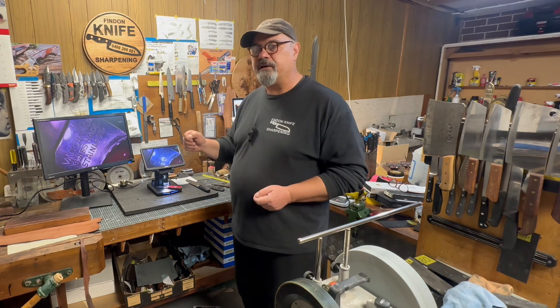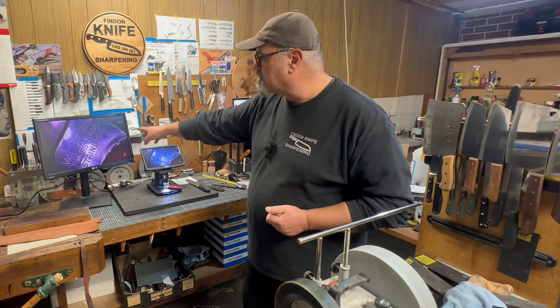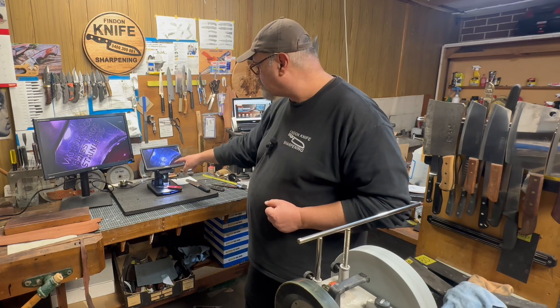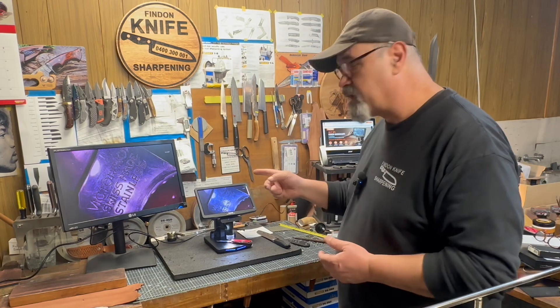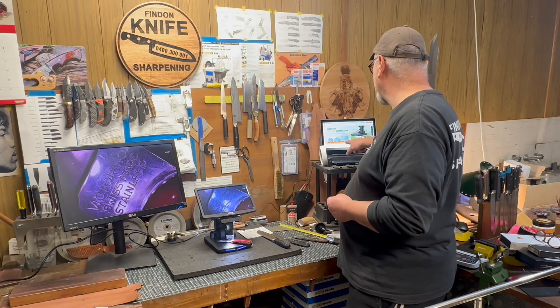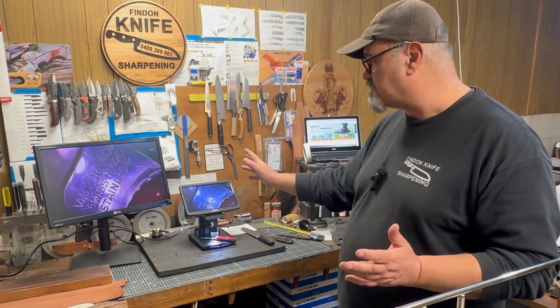It can export to another monitor, which I've set up over there - don't mind the purpleness, that's my monitor gone a bit wonky - but it's pretty sharp and the quality is very good. It goes up to 1300x magnification. The last stage of magnification seems to be digital, so I've lowered it down to non-digital pure optical, and this is what you're looking at here, which is plenty big enough for us.